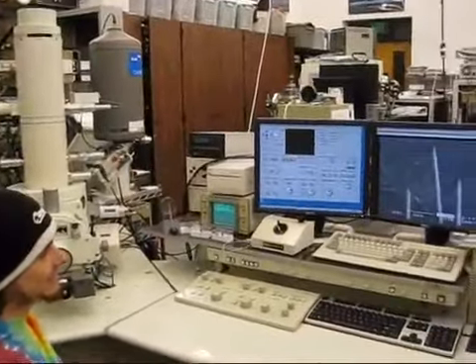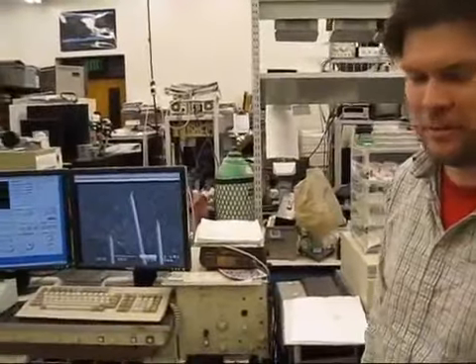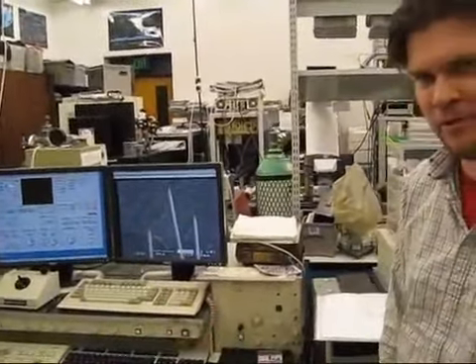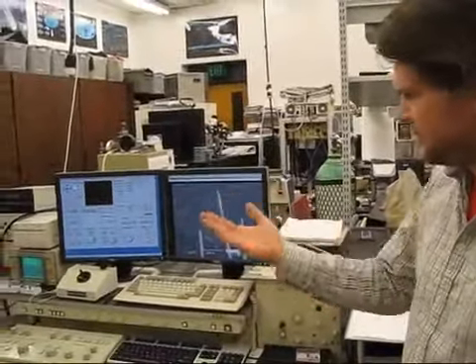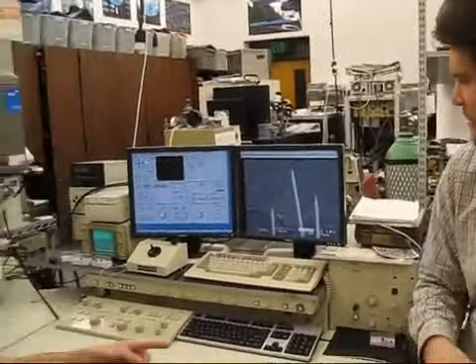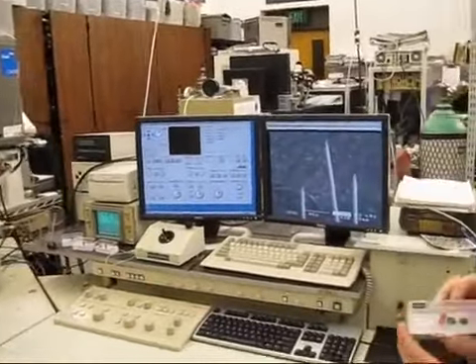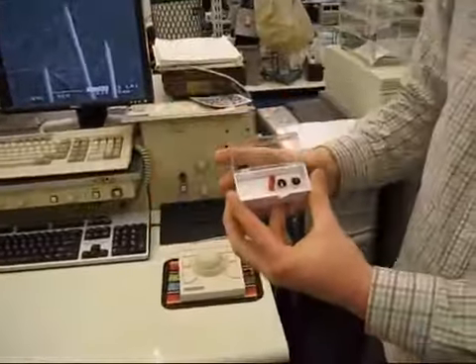So we've chemically etched the probes, and now we're going to bring them into the scanning electron microscope and look at their initial geometry so we can get an idea if they're going to be a suitable probe for our needs. From there, we're going to take the probes out and physically mount them to quartz tuning forks, which I can show you what those look like. I actually have some right here. These two guys here are quartz tuning forks.